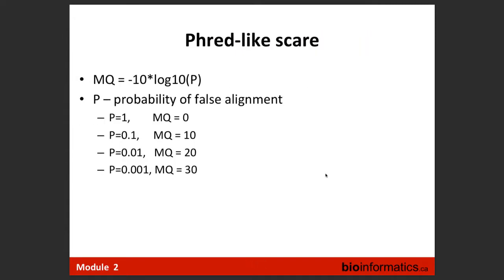By the way, something I forgot to mention, and which is interesting. We spent quite a bit of time talking about base quality in the sequencing. I'm not aware of a single aligner, except one, whose author passed by a couple of hours ago when we started our session, that tried to use base qualities. Normally BWA, Bowtie, Novoalign just ignore base quality. You use base quality to select your reads, to say, well, I don't like this read at all, chuck those reads. However, the aligner doesn't use those.